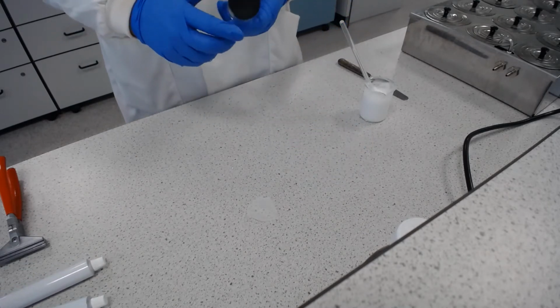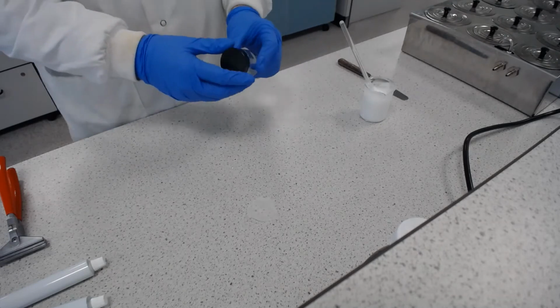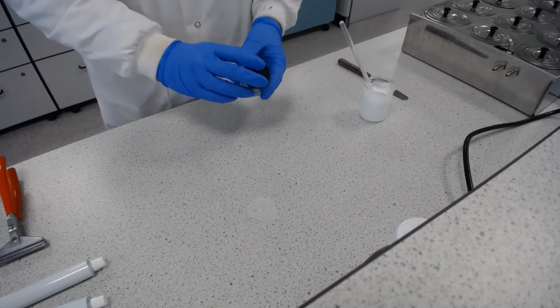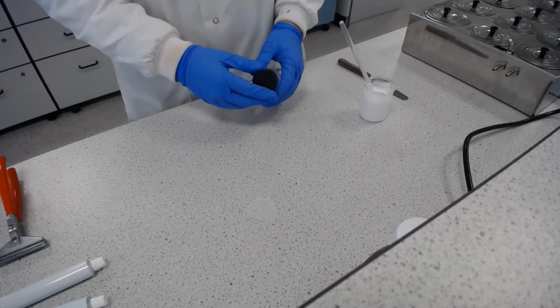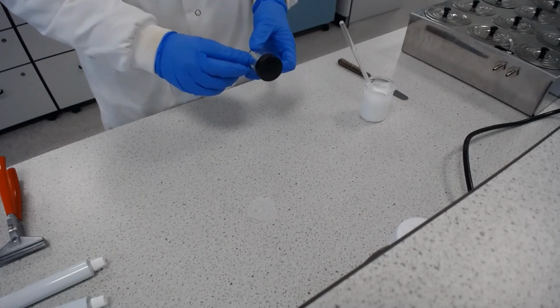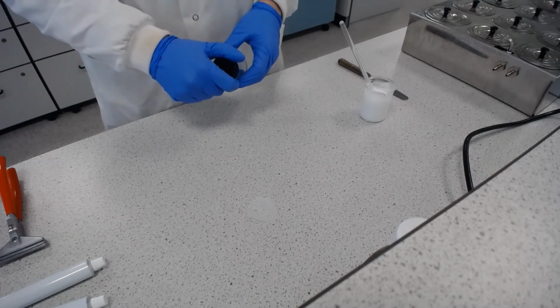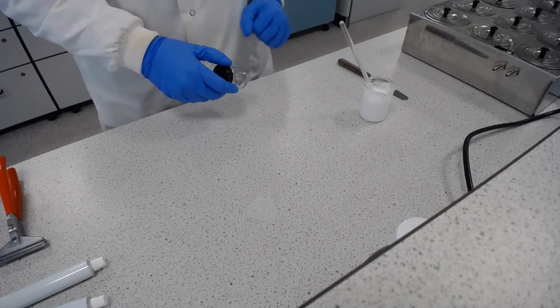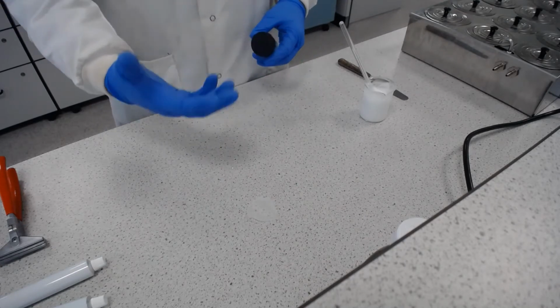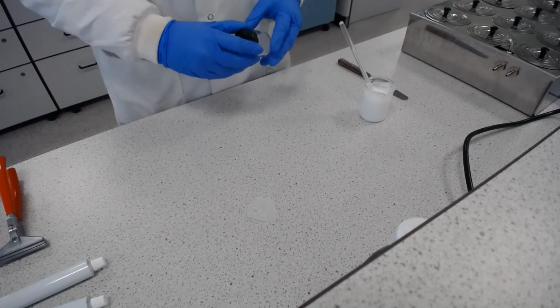Now, before, if you remember, we weighed this pot at the beginning to see how much its mass was. So what you're going to need to do is fill it about 3/4 of the way full, then put the lid back on, and then weigh it on the balance and see how much you've got, and put in as much as you need up to the amount prescribed, so 25 grams in this case.